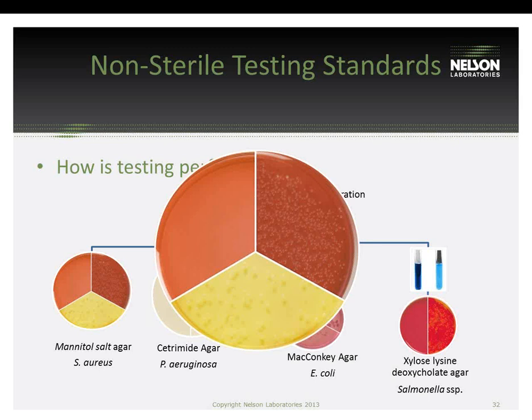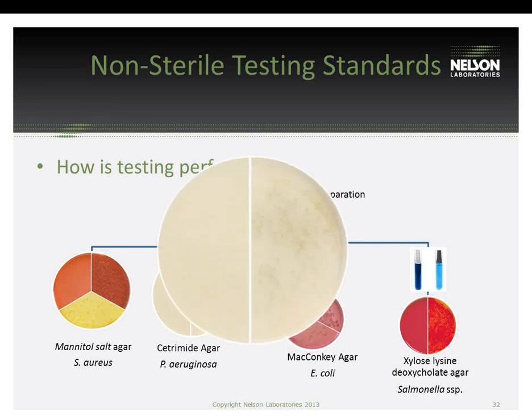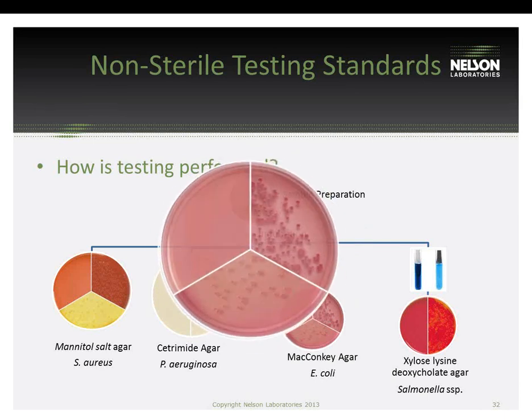But it's also differential, because if Staph aureus grows, as you can see, there are yellow colonies with yellow halos, whereas in the top right, that gram-positive, probably Staph epidermidis, doesn't have the same characteristics. For Pseudomonas, as you can see, there usually are green colonies, and they kind of smell like grapes.